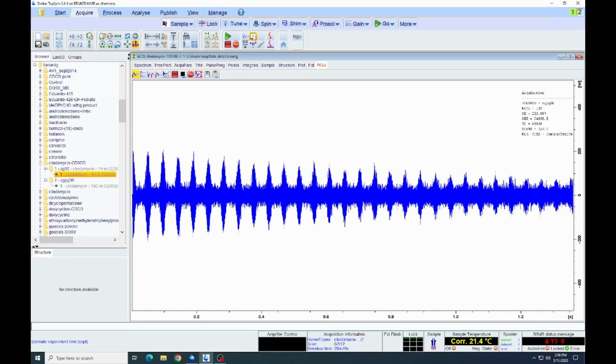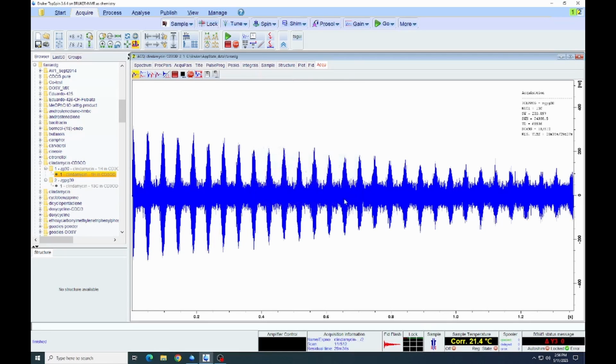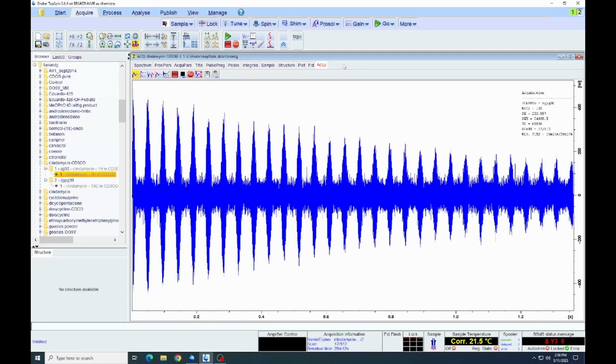And you can see we're already getting some decent signal compared to the noise. We have that flat line. It goes down the center. That's our noise, and then the peaks going above and below that is the signal. And so it looks like we will have a spectrum with good signal to noise. We're not going to sit and watch it collect for the next 25 minutes, and so I will jump ahead on the acquisition.